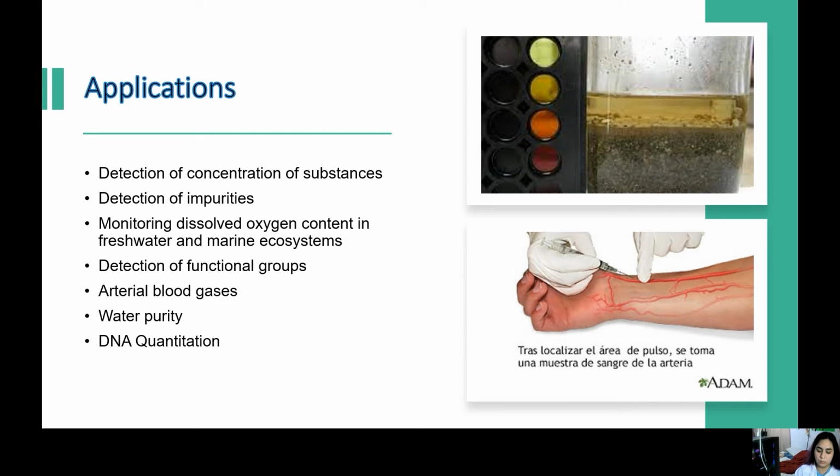And we can do respiratory gas analysis in hospitals. We can determine the molecular weight of some compounds, and we can also determine or see if there is some compound in a solution or some preparation that we think is pure.